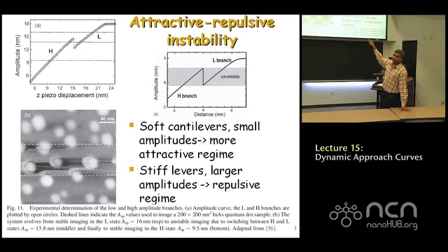By the way, you might think, why do I need to look at the phase? Because if there's going to be a switch in amplitude whenever I switch from one state to the other, why don't I use that as an indicator? It's not a very good indicator. You should always go by phase, because there are some examples where you cannot tell with your eye if there's a jump in amplitude as you approach a sample. You just have to follow the phase. That's the most sensitive indicator, okay? All right, so L would be what we would call this net attractive oscillation state. H would be what we would call the net repulsive force state.